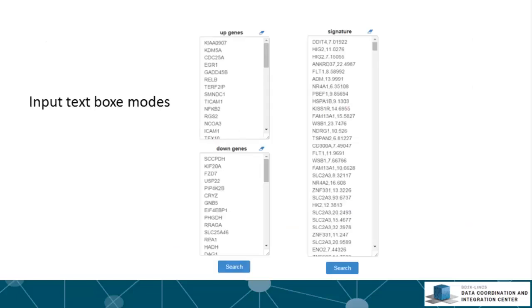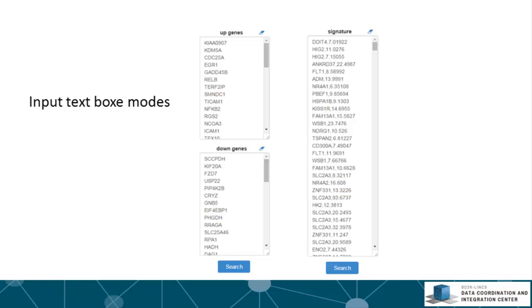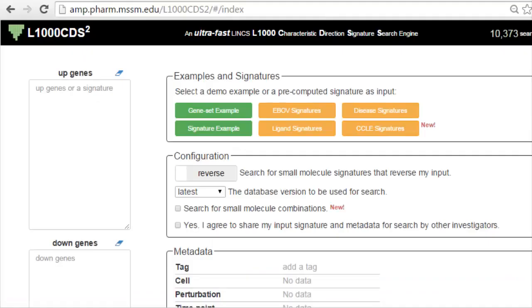The entry point into the L1000 CDS² app is to paste up and down gene lists into the up and down gene text boxes or paste a signature into the app gene text box. A signature is a list of genes with the differential expression value separated by a comma from the gene ID.